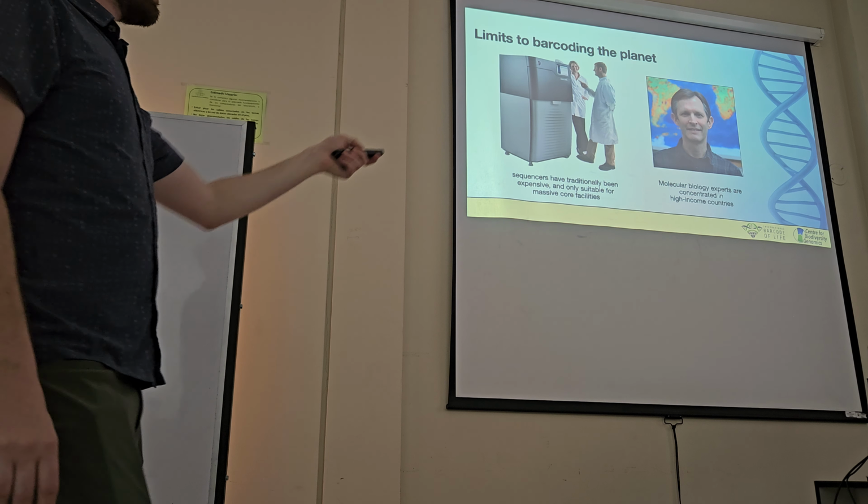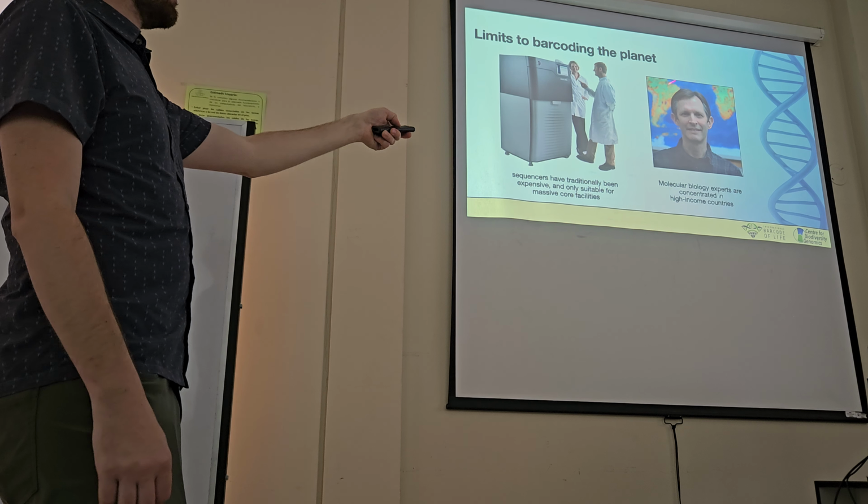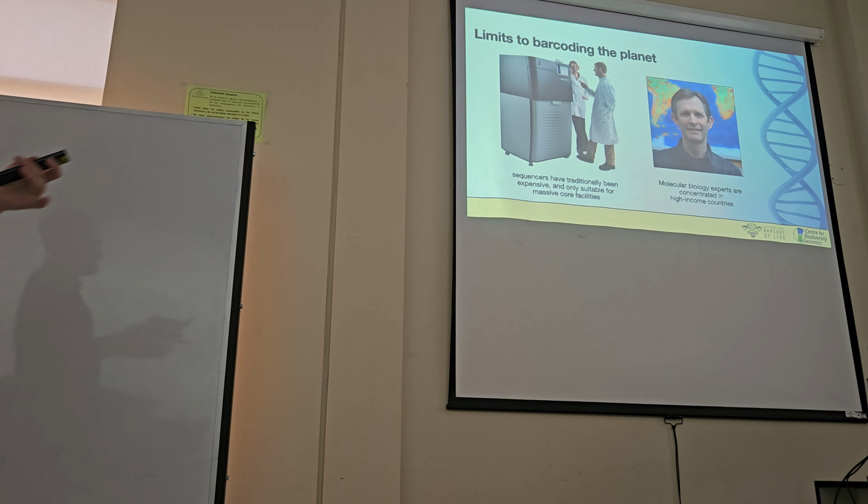And Robin and other people in our lab who have a freeze dryer and all the expertise and all the primers that I can't even make, he can freeze dry the complex chemistry and mail it, so it's so easy for people in different countries to just add water. It means you don't need people with PhDs in molecular biology to do barcoding workflows. You can have somebody you trained in a workshop for 2 days, and then they can do the whole thing. So it makes it very simple.